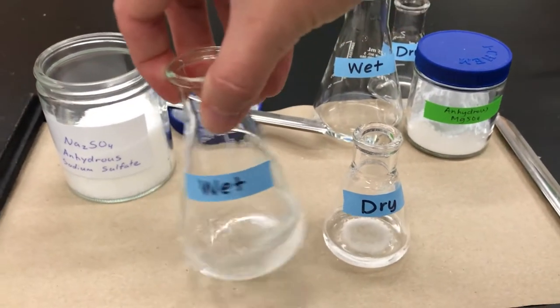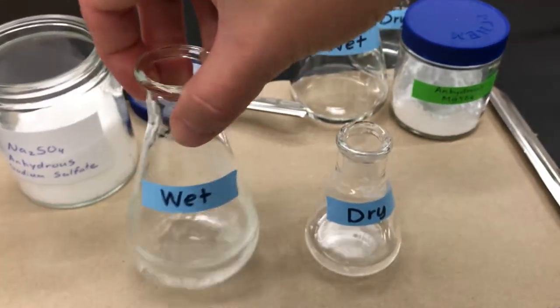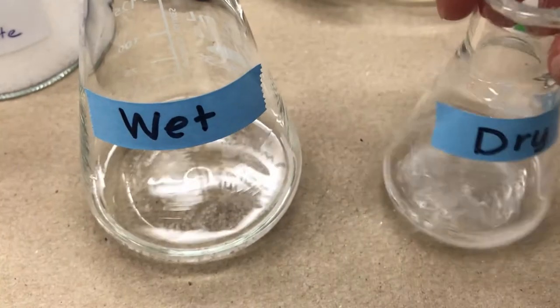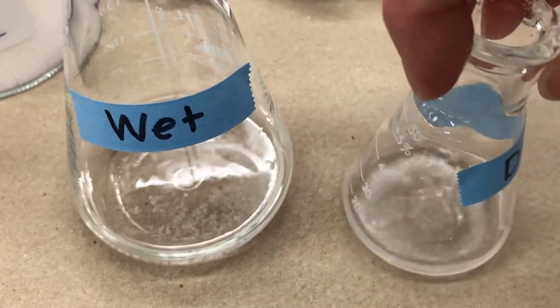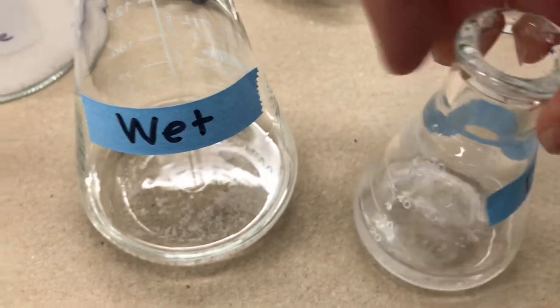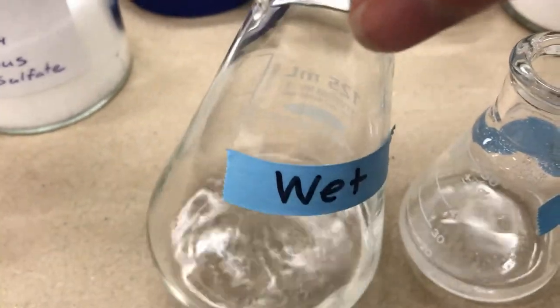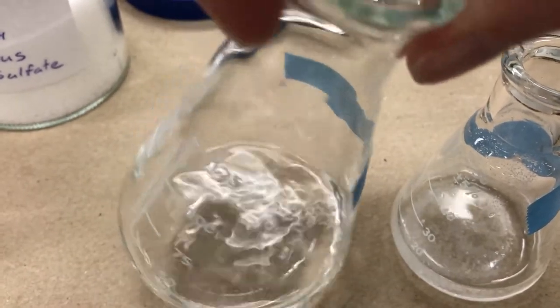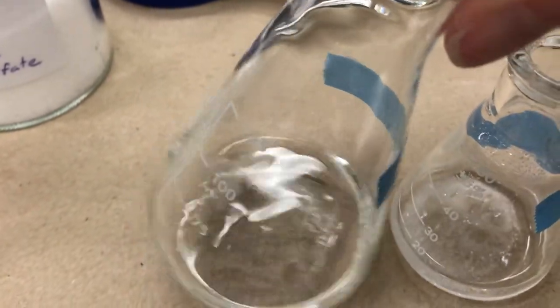It's going to be quite difficult to see, but what happens is when there's water in the solution the sodium sulfate clumps with it — that's when it forms the hydrate. On the right, since there wasn't any water, the particle size of the sodium sulfate remains unchanged and small. On the left with the water, the clumping causes it to become a big mass.